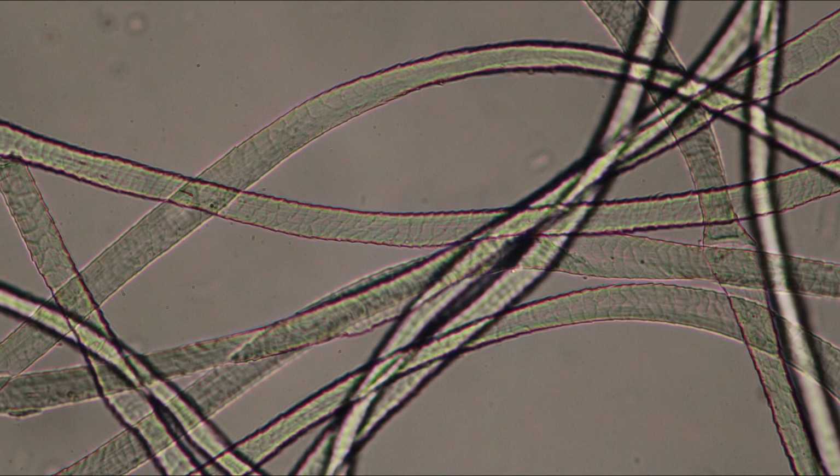So subjectively the image looks better, but in reality those diffraction patterns actually start to cover up some of the image details. It appears now much more easily visible, what you see, but it is also like this that it's not a natural representation.